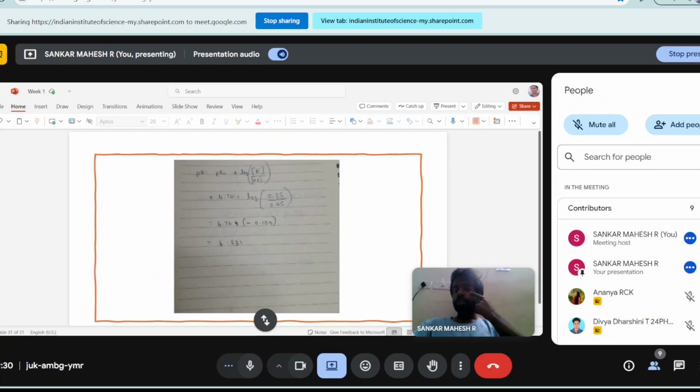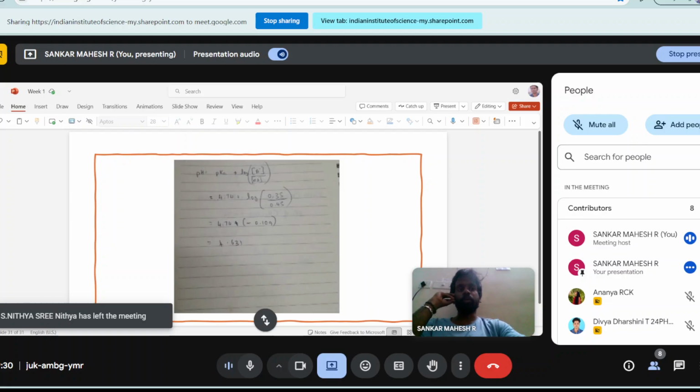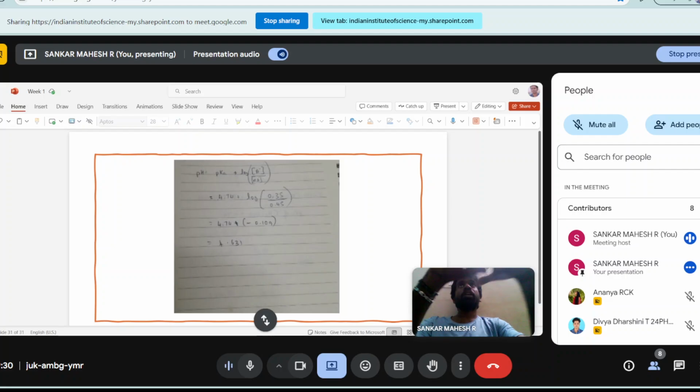Where I'm going with this question is that we are well aware that we can keep acid in glass containers. That's okay, no problem with that. But what if we keep bases in glass containers? The etching will happen. So the context here is you do not use the same glass containers for spectrophotometric readouts. When you're doing spectrophotometric experiments, you are trying to measure the number of photons, and that should not be altered because of this etching. That is what people are worried about in this particular question that we discussed today. So as long as your etching doesn't affect your photon traveling and reaching your sensor, you do not have to really worry about it.